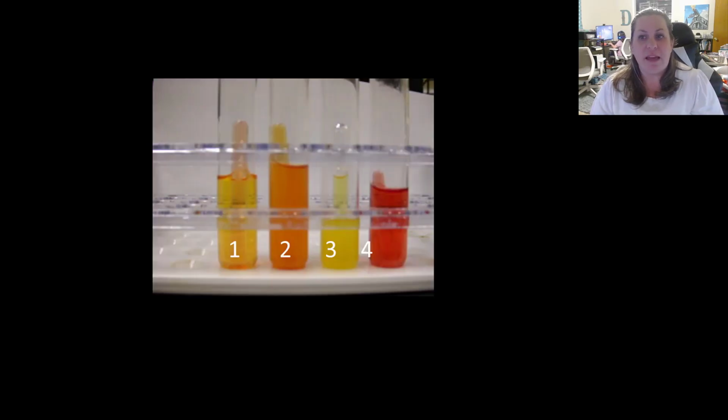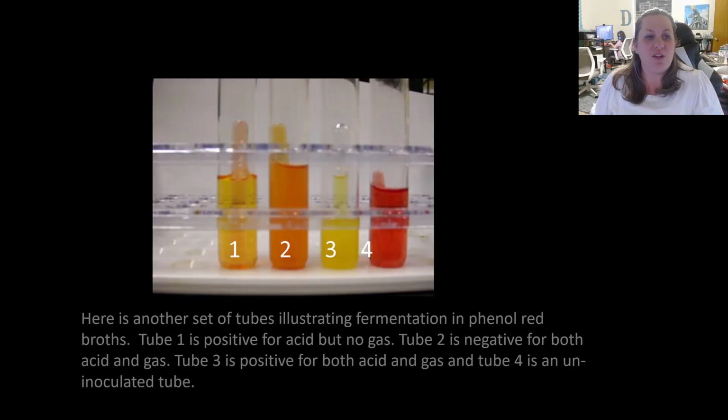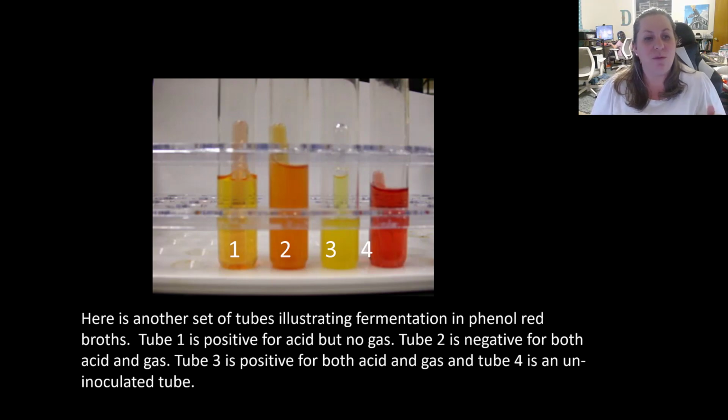So here's another example of a set of tubes. As you go through here, we can see that tube 1 is positive for acid because it's turned that yellowish. It's kind of orange, but it's a yellowish color. But you'll notice that the tube inside has no gas bubbles in it. So this would be positive for fermentation, or for acid, but it would be negative for gas.